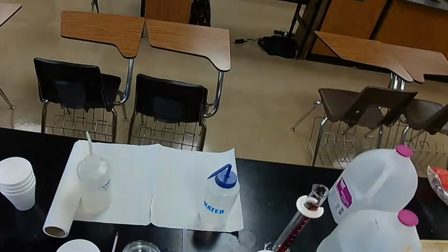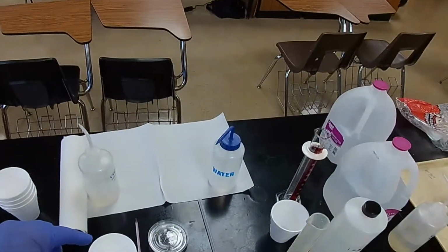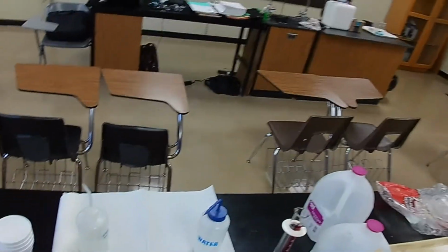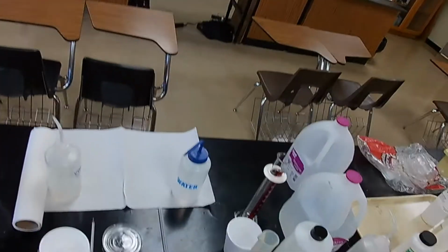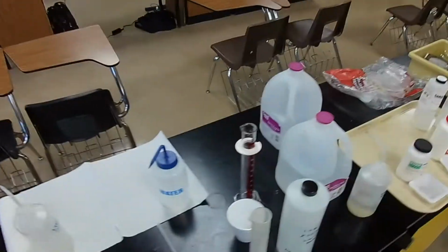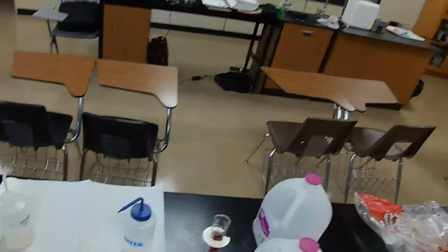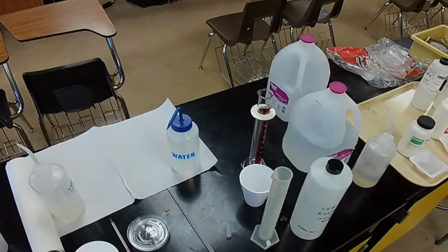So, what's the total mass of water in the calorimeter? It's 60 milliliters of sulfuric acid, 60 grams, and 50 of potassium hydroxide. So 60 plus 50 is 110 grams is the total mass in the calorimeter.